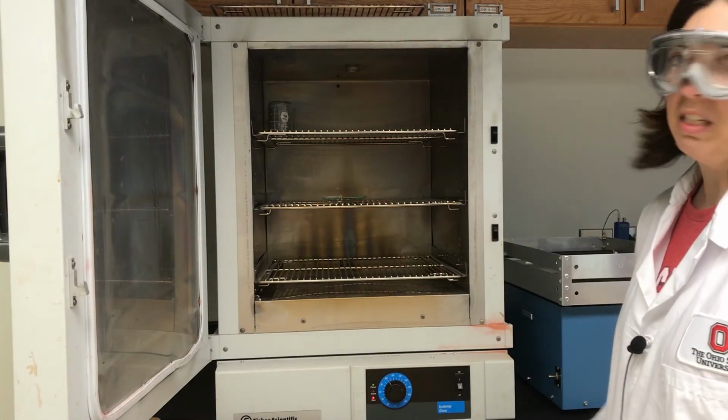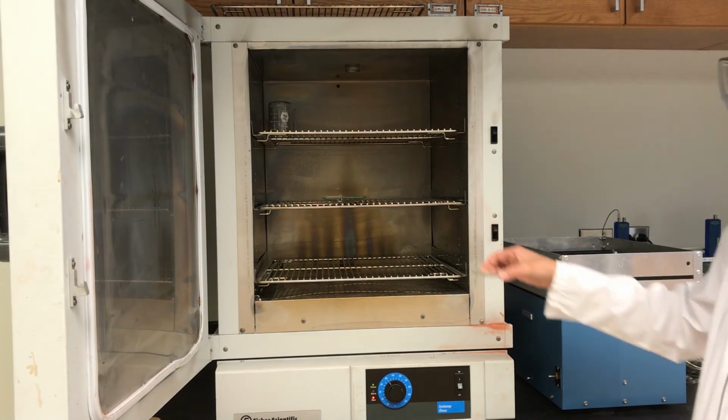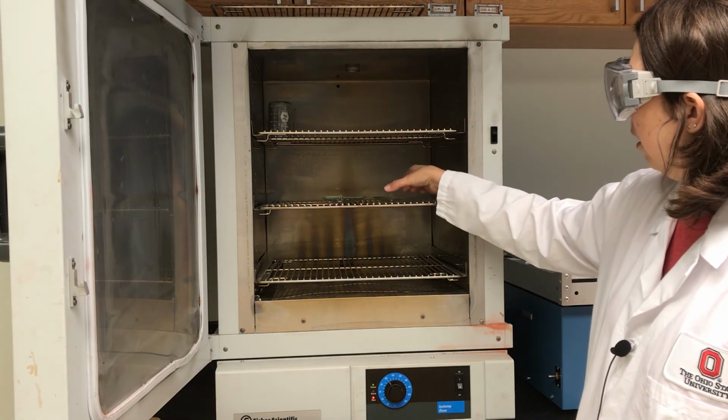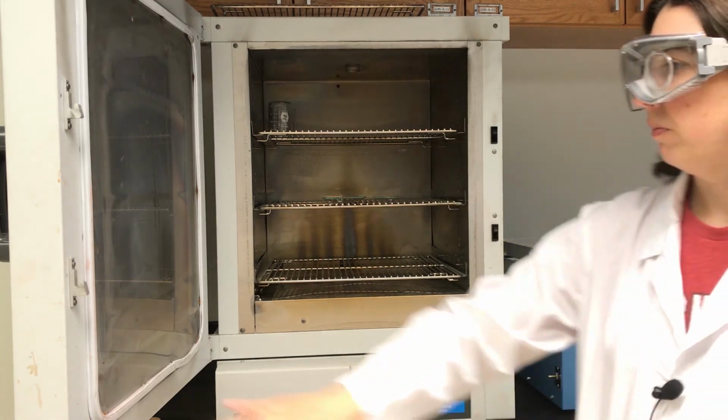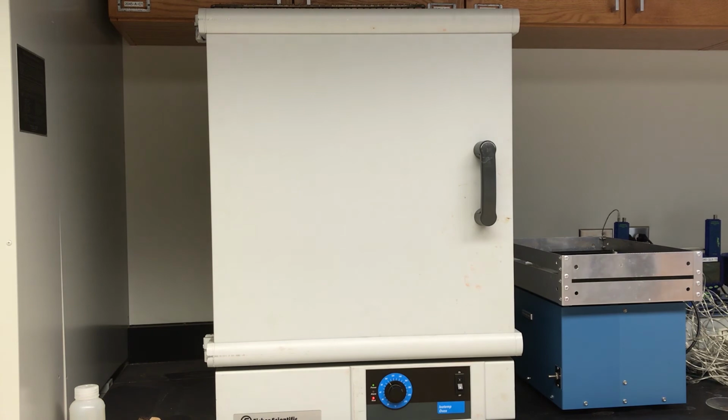All right, and so here's the oven. You can see there's actually a sample pan in here that's currently drying. So I'm going to take my watch glass with my clean pan and just place it in the oven. The oven is right now set at about 100 degrees Celsius. The temperature matters less than making sure simply that your pan is dry. So if someone has an experiment going on where they need an oven at a certain temperature, go ahead and use the oven. Don't adjust the temperature. So we'll let the sample pan dry in the oven.